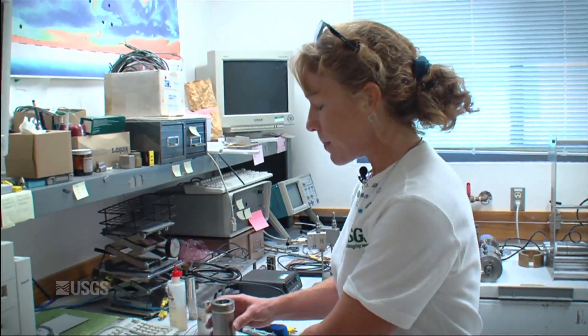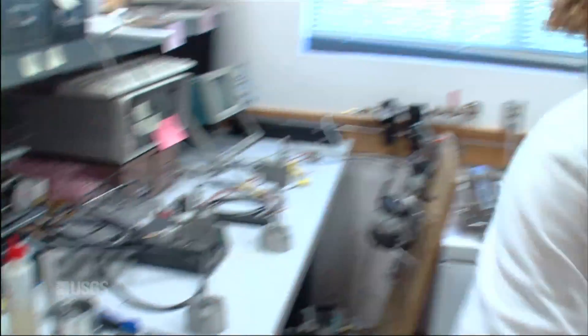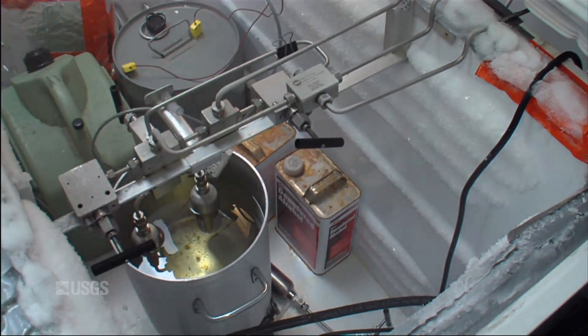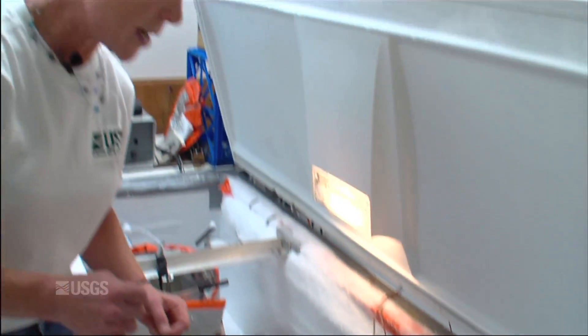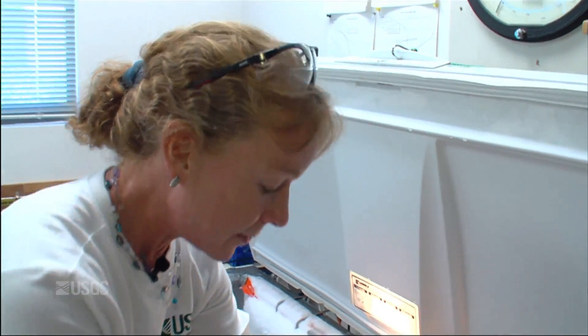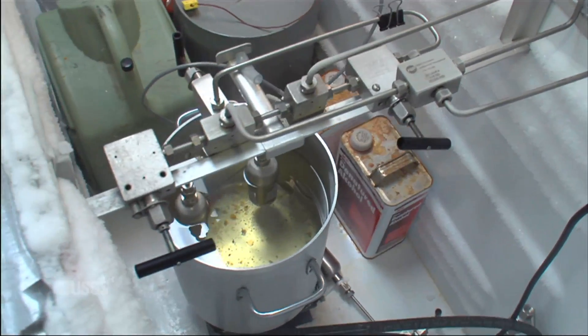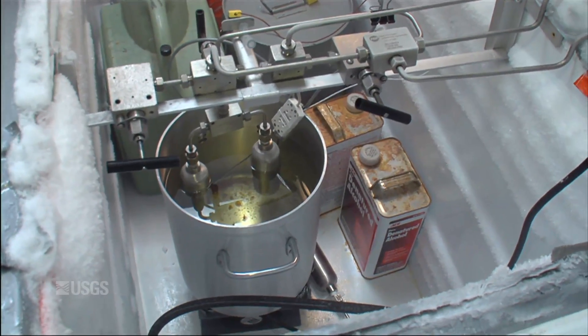We start in the main portion of the lab making ordinary water ice that we use as a reactant for the hydrates. We grind and sieve that ice, pack it into pressure vessels, and put it into this freezer. We load them onto these two ports, evacuate all the pore space between the ice grains, and then use reservoirs of pre-chilled gas to fill that pore space and react with the ice to make hydrate.